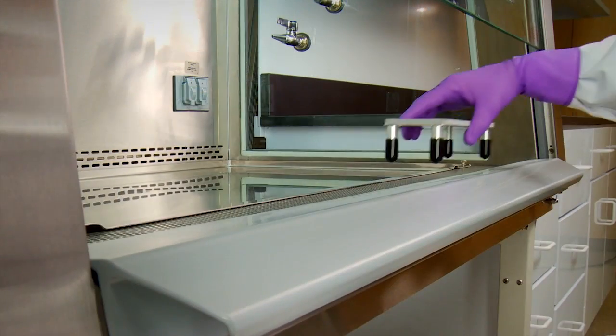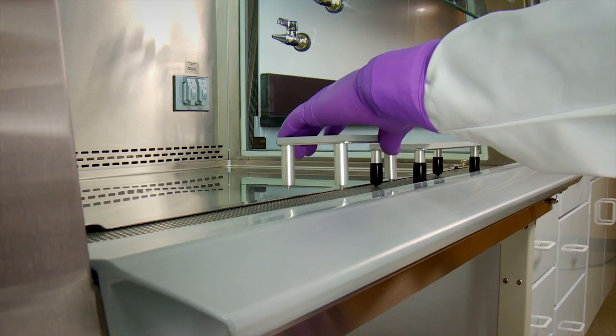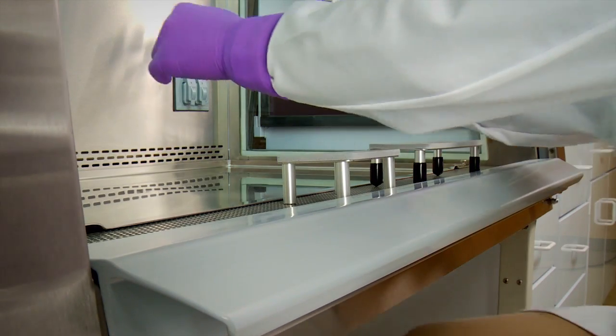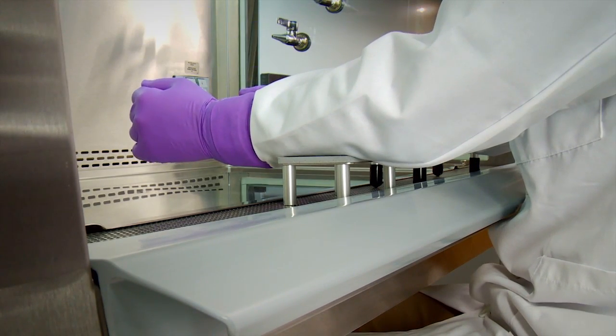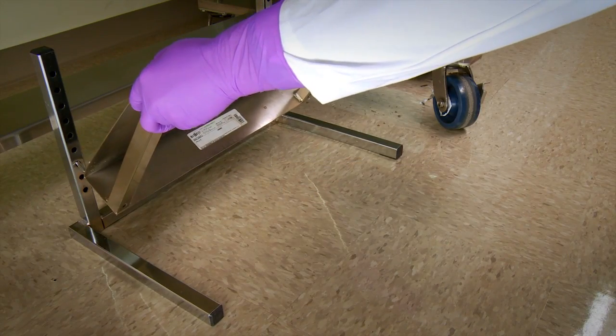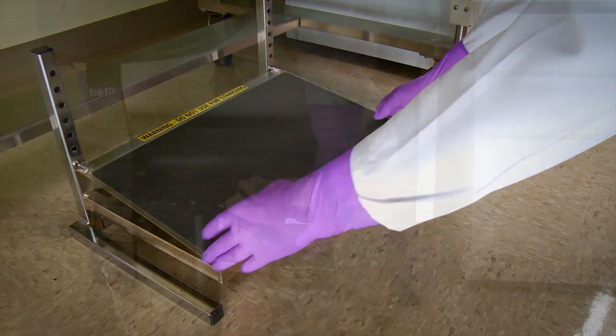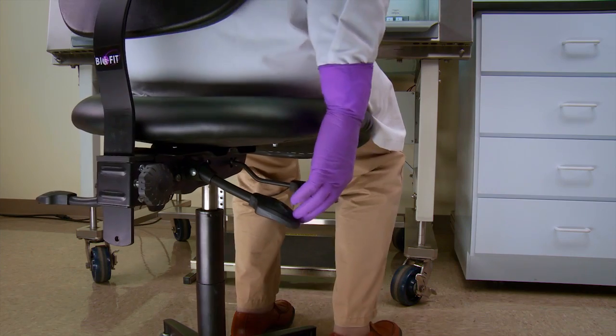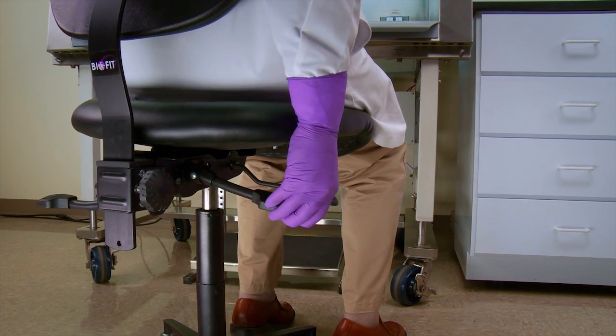Closed cell foam padded elbow rests provide variety to repetitious activities such as pipetting while keeping the airfoil unblocked. A footrest under the cabinet provides correct body positions. An ergonomically designed chair corrects improper body positions.